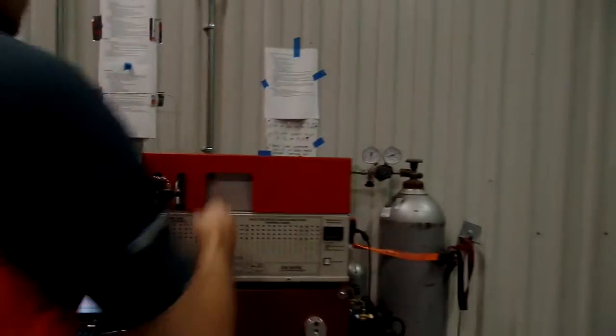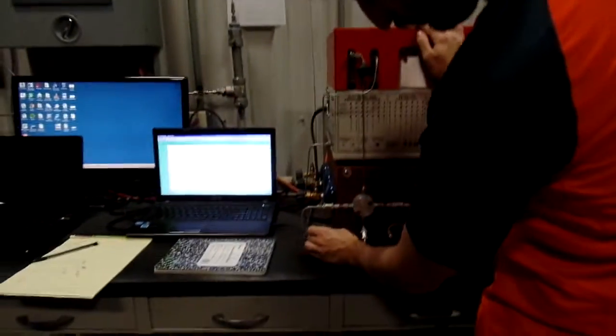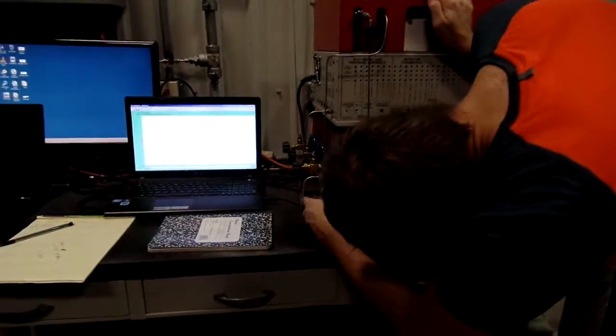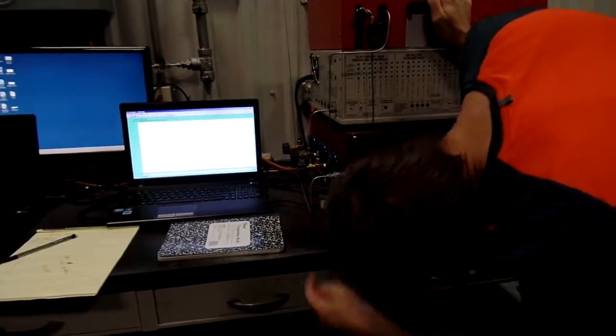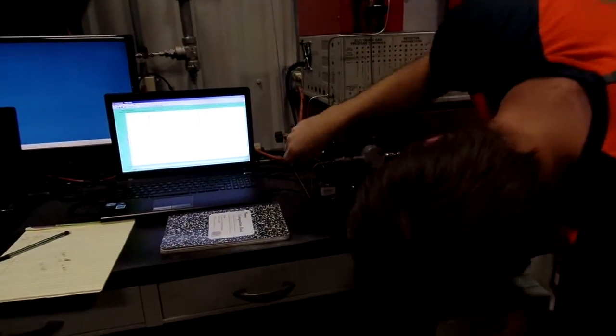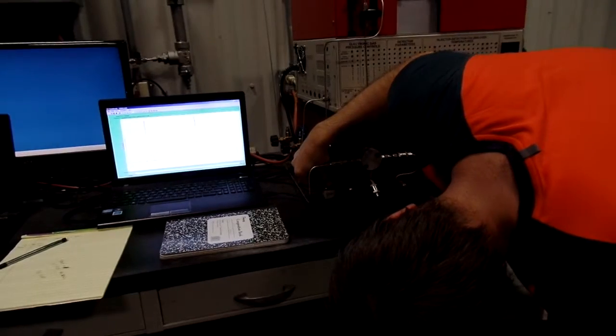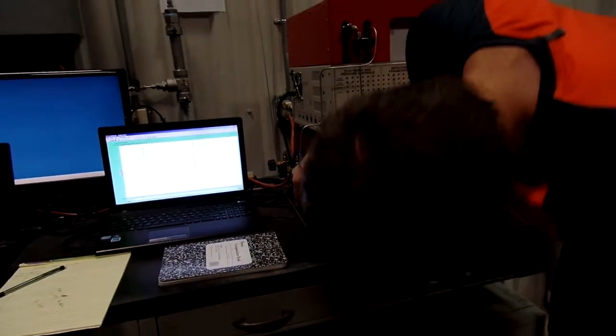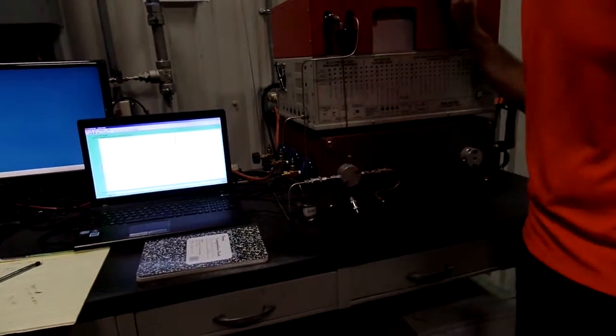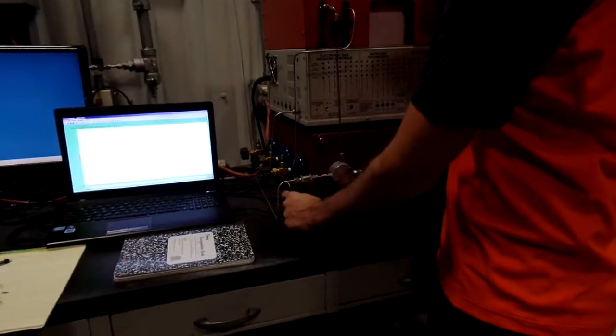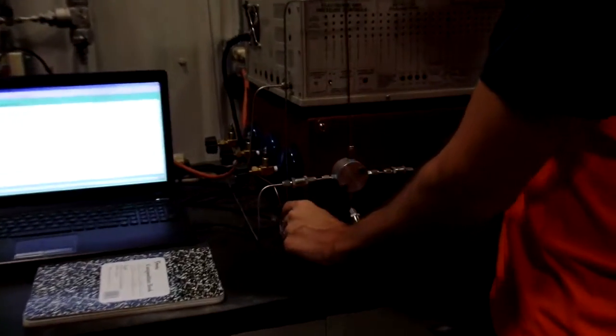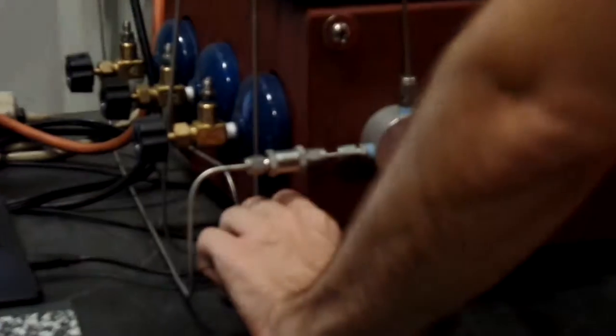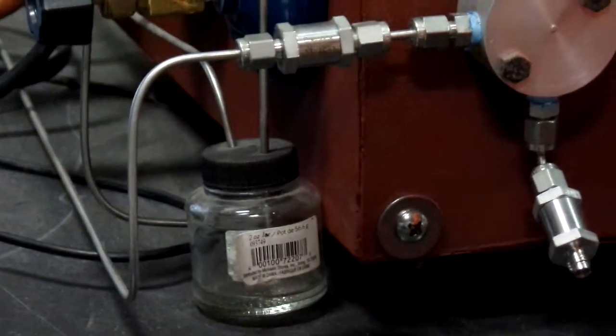So what's going to happen is this guy just sealed. Water in there? There's still water in there. Maybe you need to get a little more water in there. But when it's sealed and the pipes have to go through, you can see the bubbles filling up so you'll know gas is flowing through.